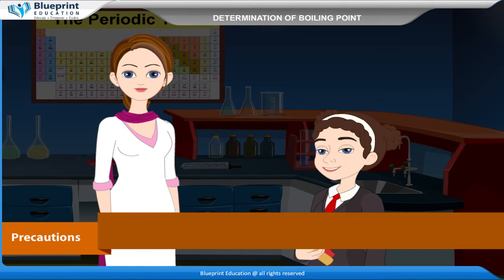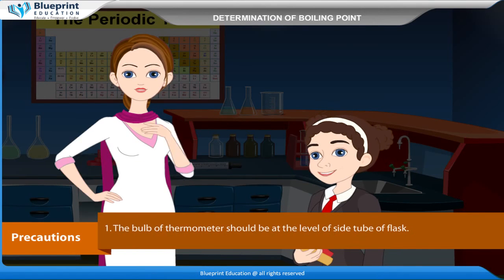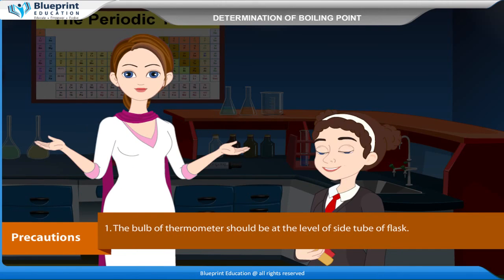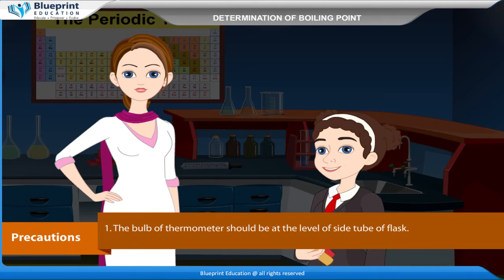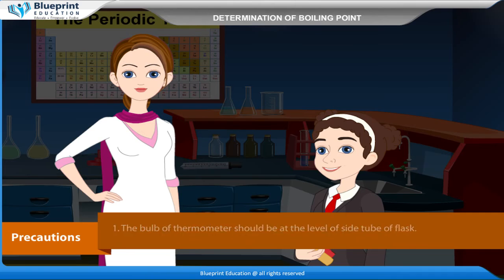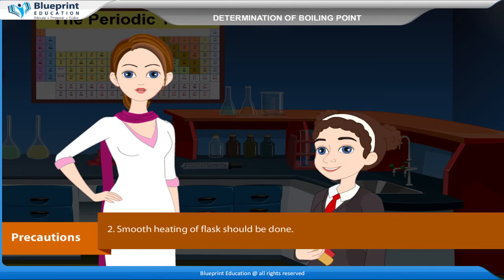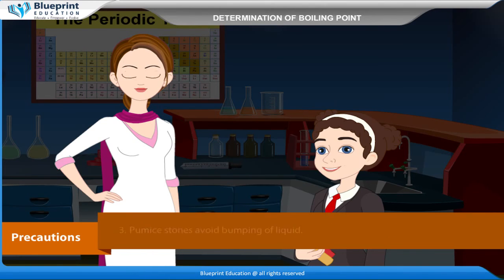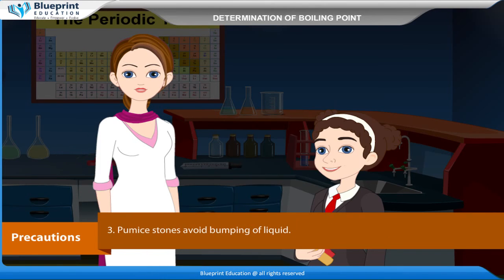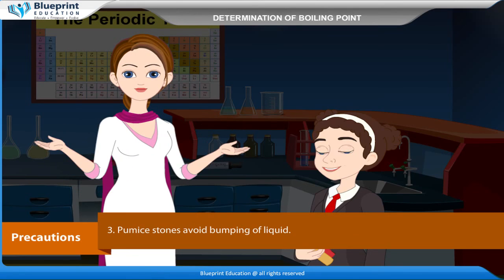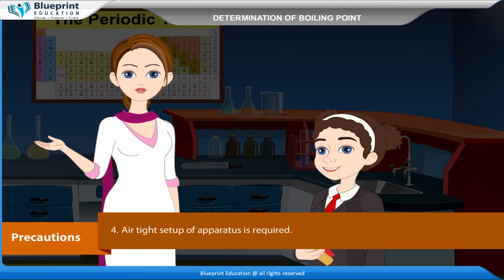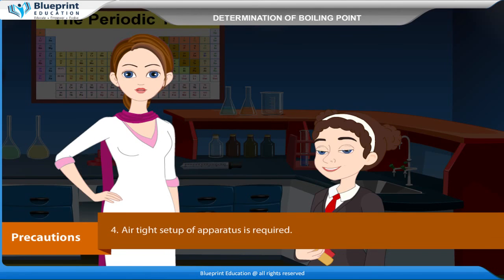Precautions: The bulb of the thermometer should be at the level of the side tube of the flask. Smooth heating of the flask should be done. Pumice stones avoid bumping of the liquid. An airtight setup of the apparatus is required.